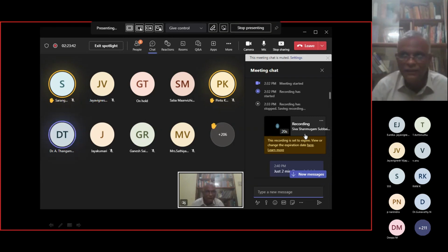Sir, actually validation is in TLC also; we are validating. I showed you how we are validating. Yes, sir. In HPLC also it is validated. But now you are saying that you are making a product.